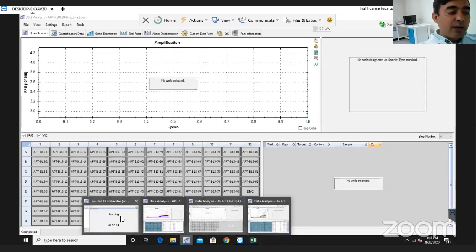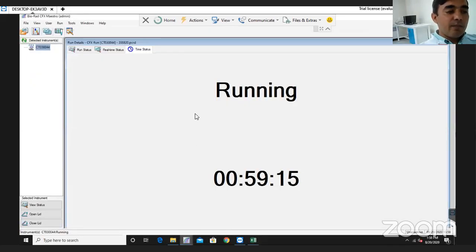For that, one doesn't need to perform the bleach process, which can be skipped, and you can simply clean the block with distilled or deionized water and molecular grade 70% ethanol. This way we can clean the block, and our machines can be cleared of false fluorescence or pseudo fluorescence molecules.